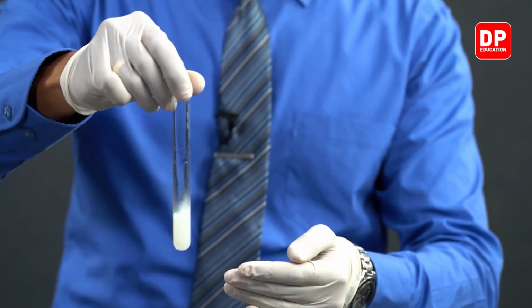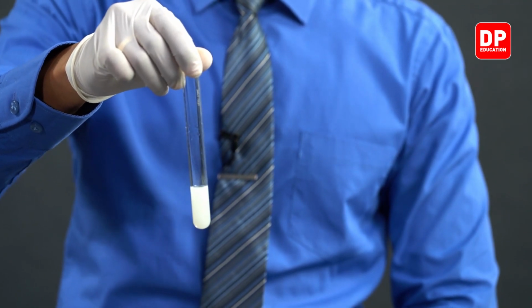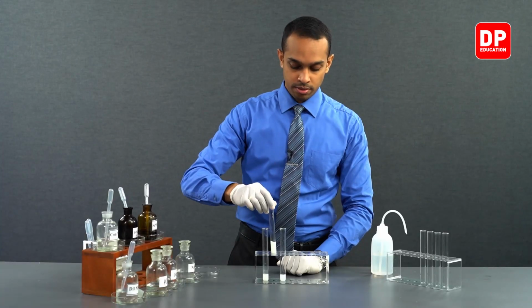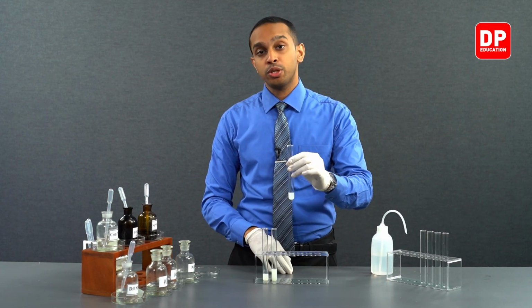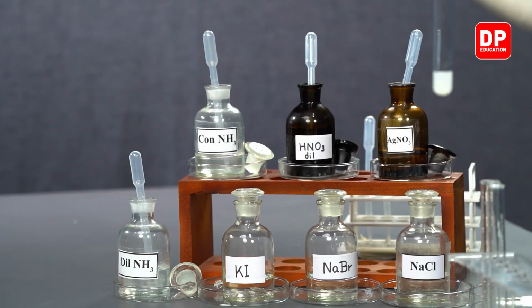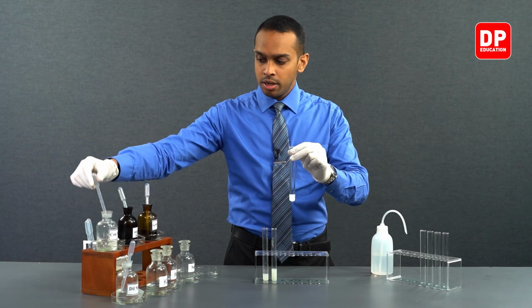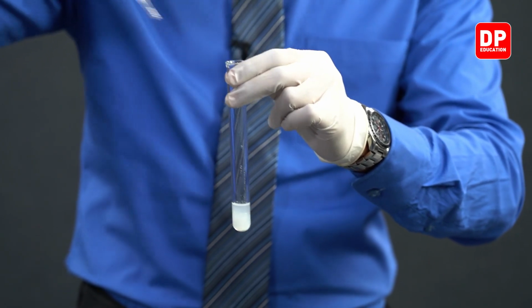As you can see, adding nitric acid into this precipitate did not bring about any change, as nitric acid cannot dissolve silver iodide that is formed. Then we will take another portion of the silver iodide precipitate we have and add a little bit of concentrated ammonia to see if it can dissolve this silver iodide precipitate that we have here.